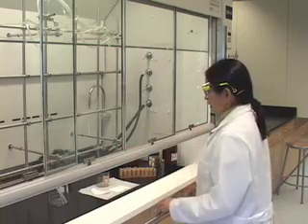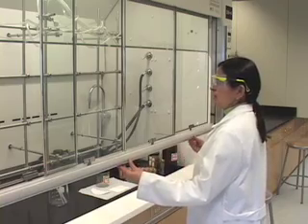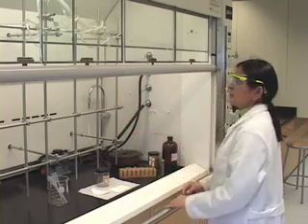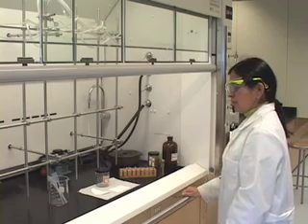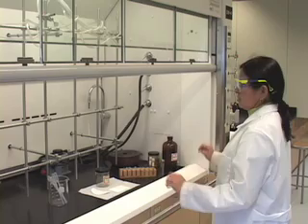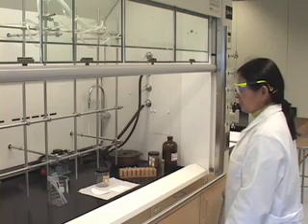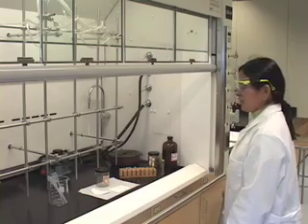For our video recording purposes of the demonstration, we will be working with our hoods raised all the way just so that the reflection of the glass doesn't interfere with our recording. Please note that this is not the correct way to be working in the hood, but we have the hood sashes raised only so that the glass reflection does not interfere with our recording.